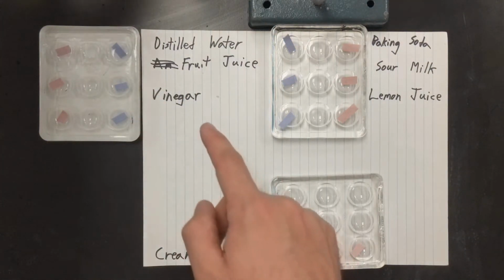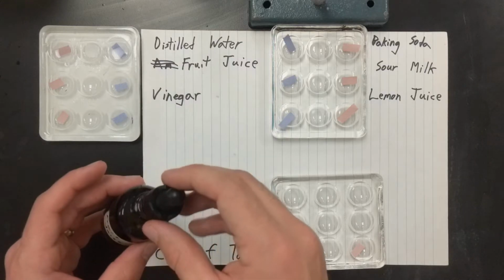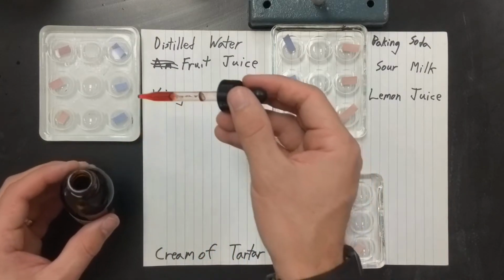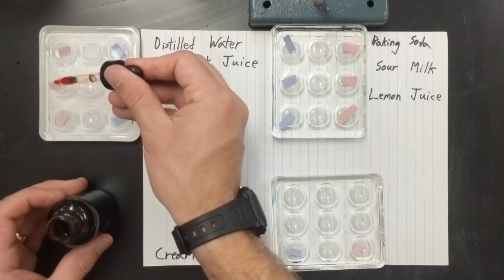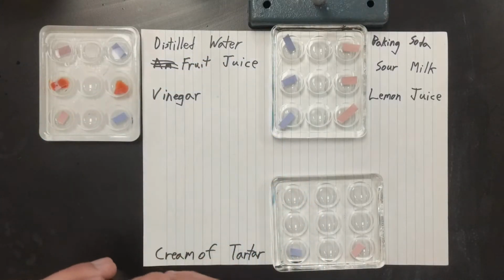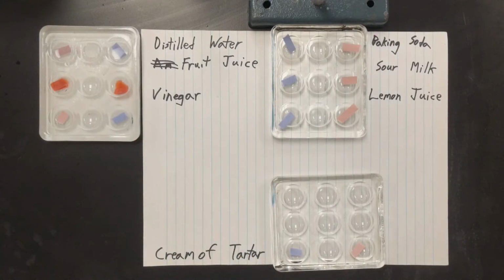So the next one on the left here is fruit juice. So you unscrew it, and we have an eyedropper. So we're going to put 1 or 2 drops. 1, 2, 1, 2. Okay, just enough so that the litmus paper gets wet from it. And we can see that they have changed color. This one is red, where it used to be blue. This one is red, where it was red before.